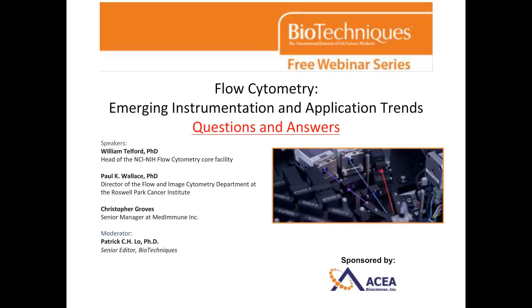Great, thank you. Paul, our next question is for you. What is the best way to assess whether you have added too much protein labeling dye and affected cellular function? That's a good question. And really the answer is, as the questioner asked, to look at function. Typically, you would want to look at whatever type of assay you're using for the cells.